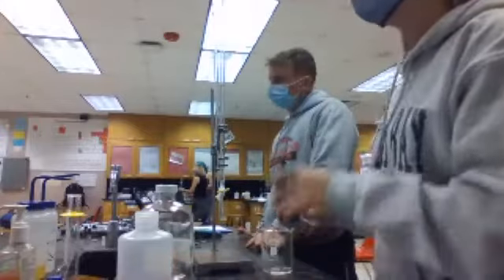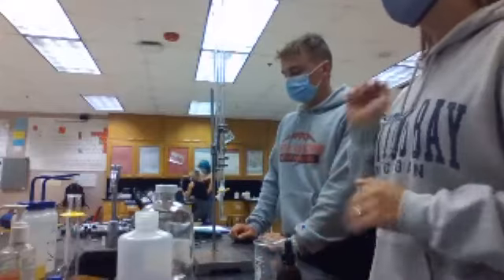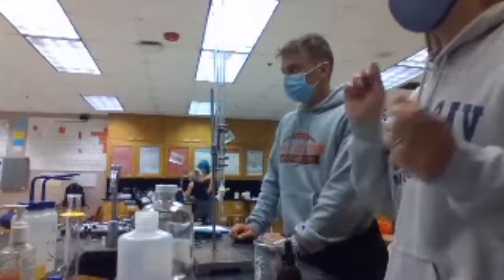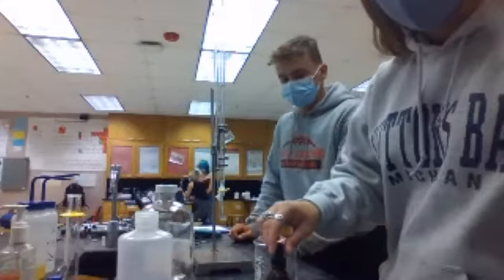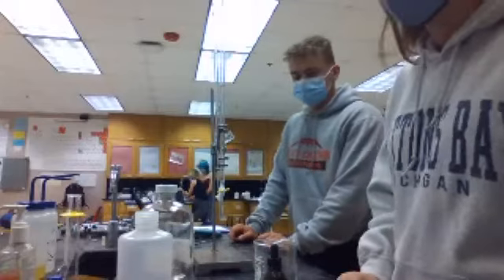And we still add 4 drops of the phenolphthalein. Okay, and then we add 1 milliliter each of the base. 1 milliliter of the base, and then take the pH. 1 milliliter of the base, take the pH. Okay, and what did you determine? How many milliliters should it be? We haven't figured that out. Somebody at home should be doing that?